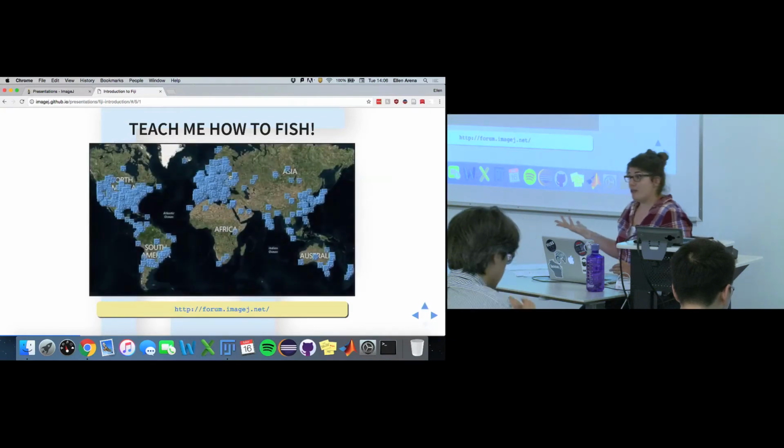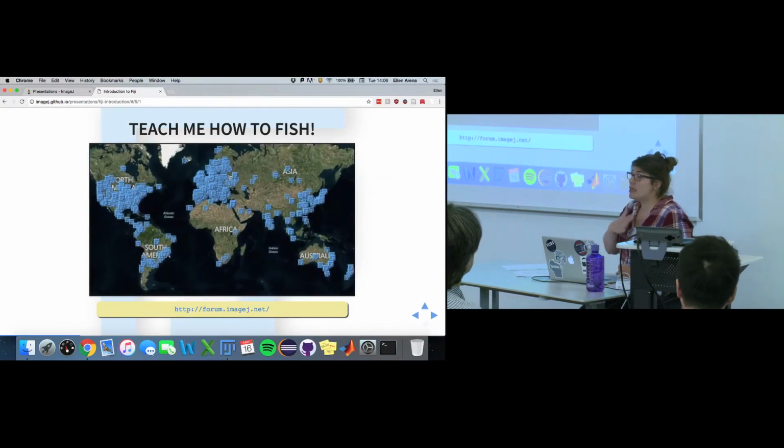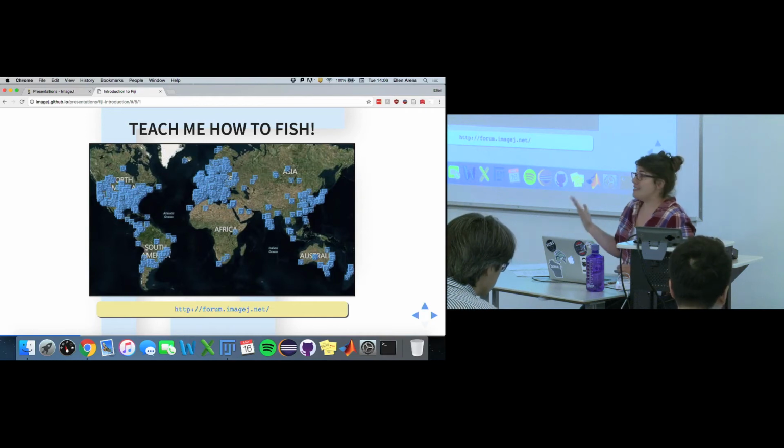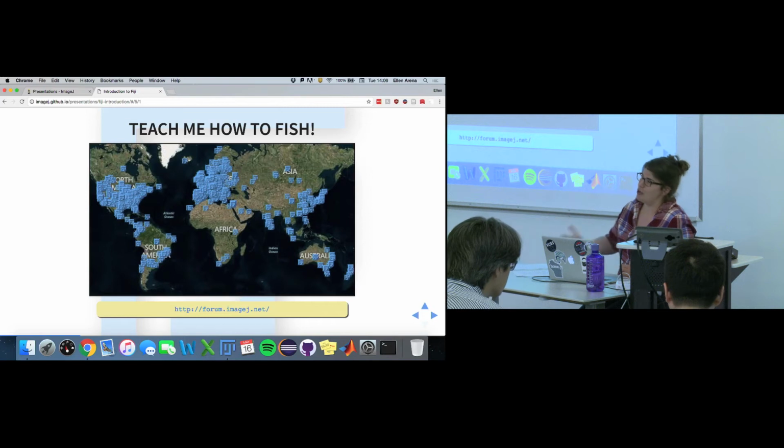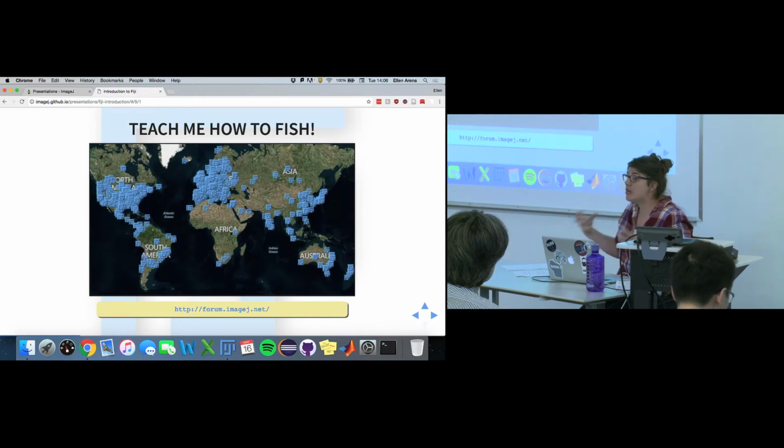What's also great about the forum and ImageJ in general is that we have a huge user community that really spans the globe. Sometimes if you're up late thinking about your question and you post something on the forum, you could potentially wake up the next morning with your answer because of the time change. So many users across the globe are on there. It's a really great tool. This is the strength of ImageJ: that community that exists and that you have access to, and one of the ways you have great access to it is via the forum.